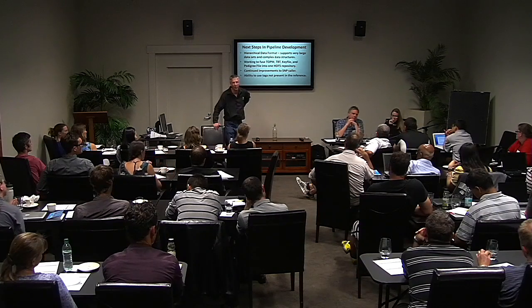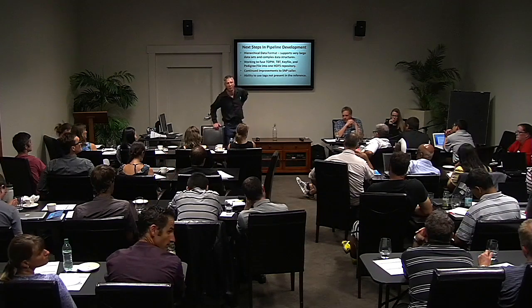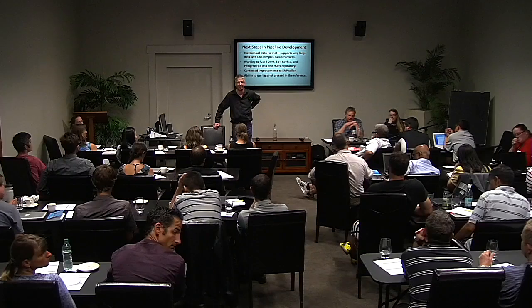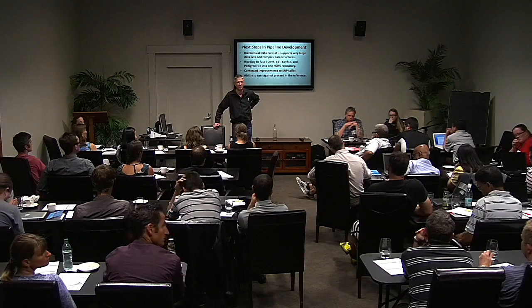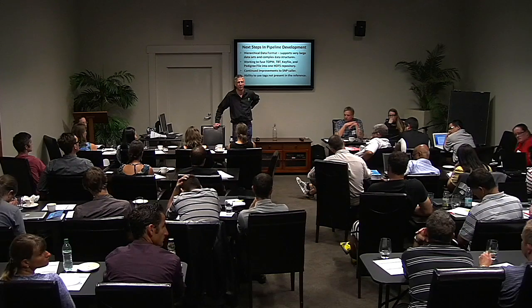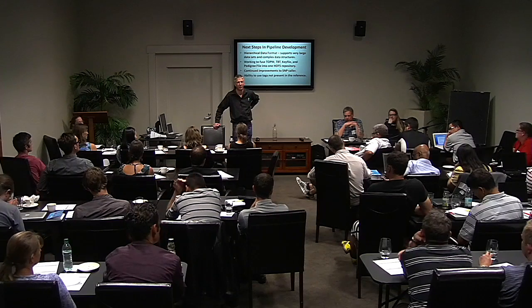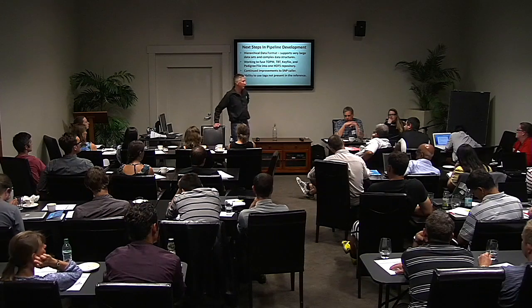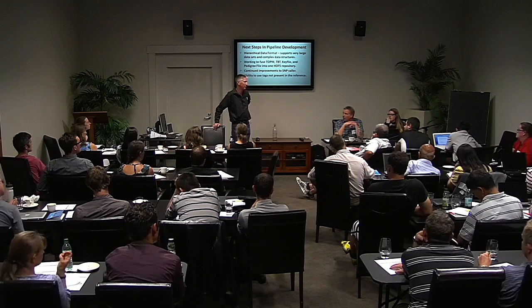Okay, John, do you have another question? Does that make sense? Yeah, probably a bit over the top, but in your file, there's no way that further downstream you might find that there's a whole lot that are paralogs and stuff like that. There's no way to go back and edit that so that you get rid of those tags?